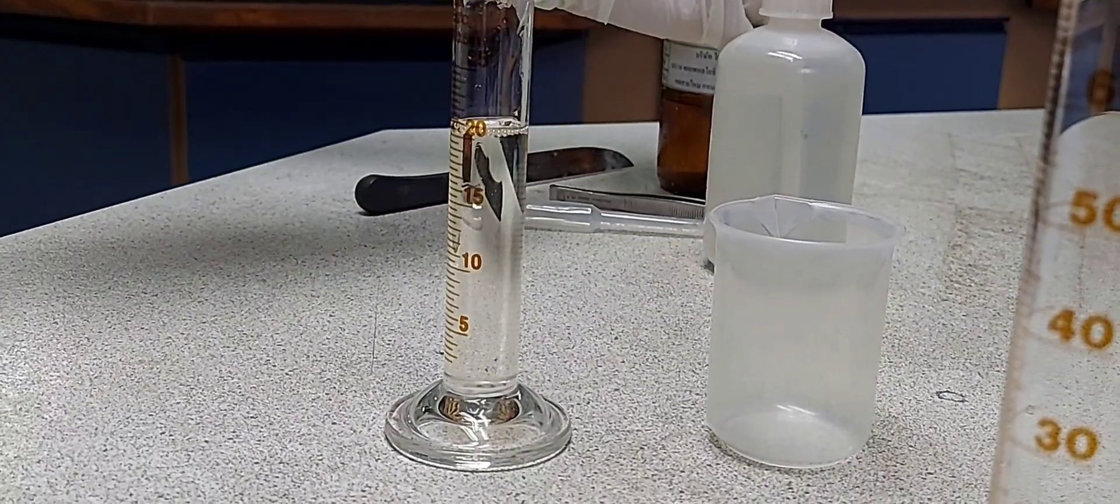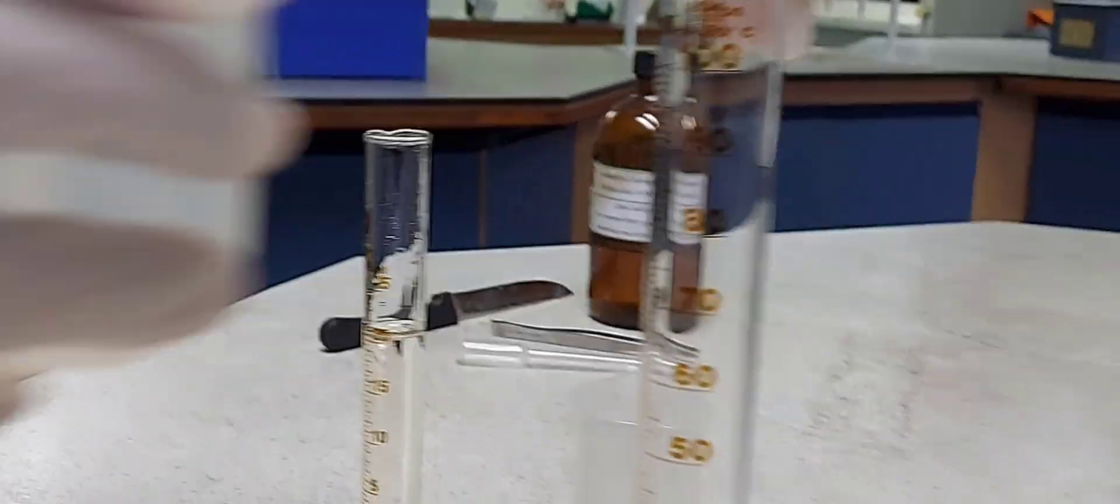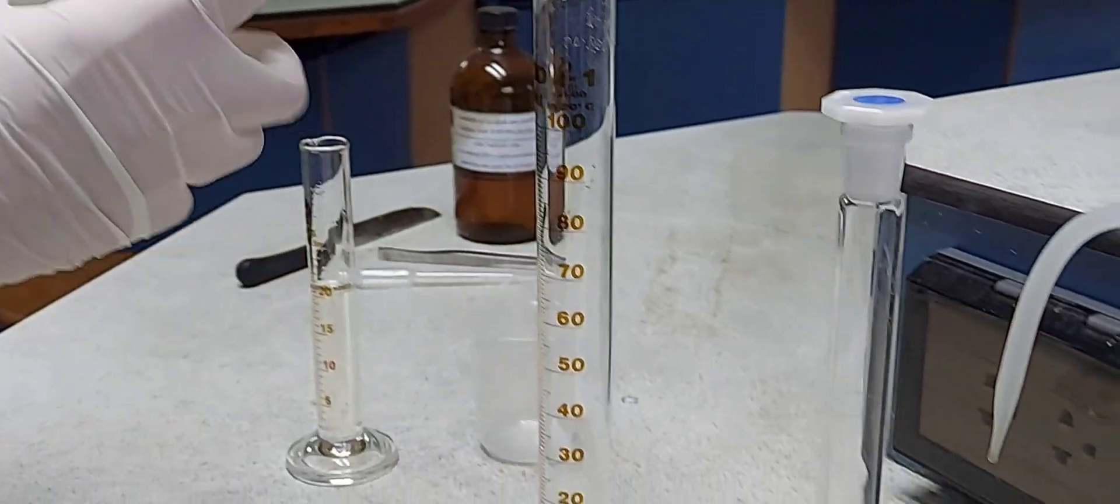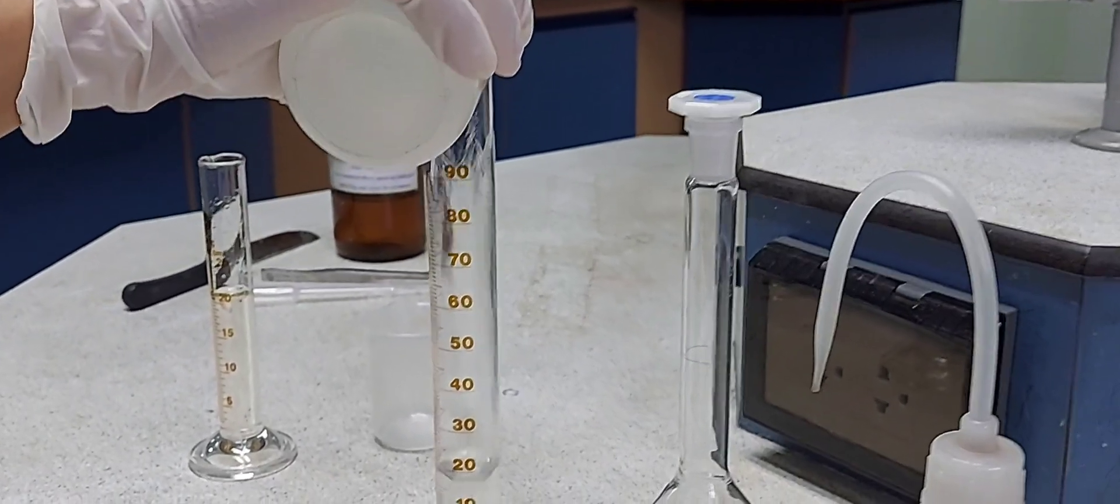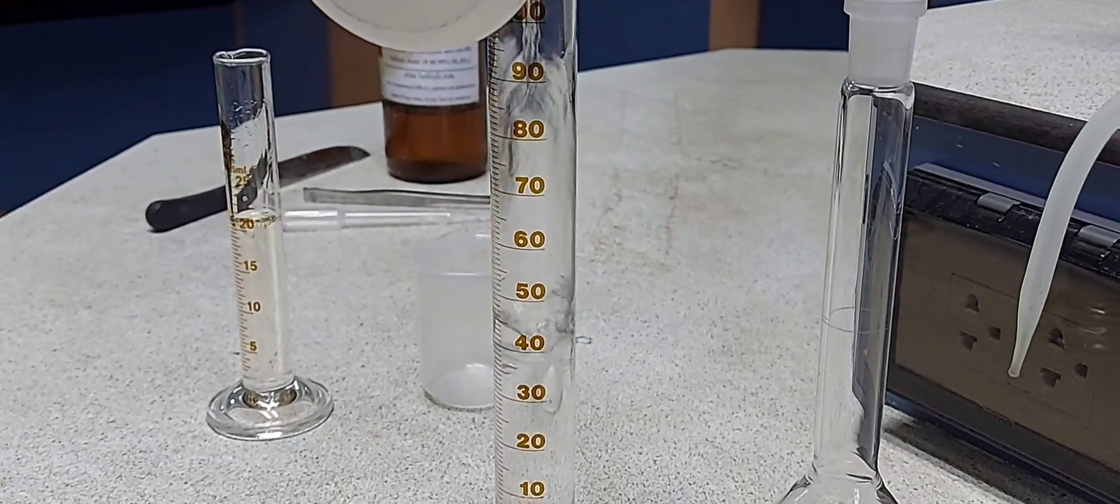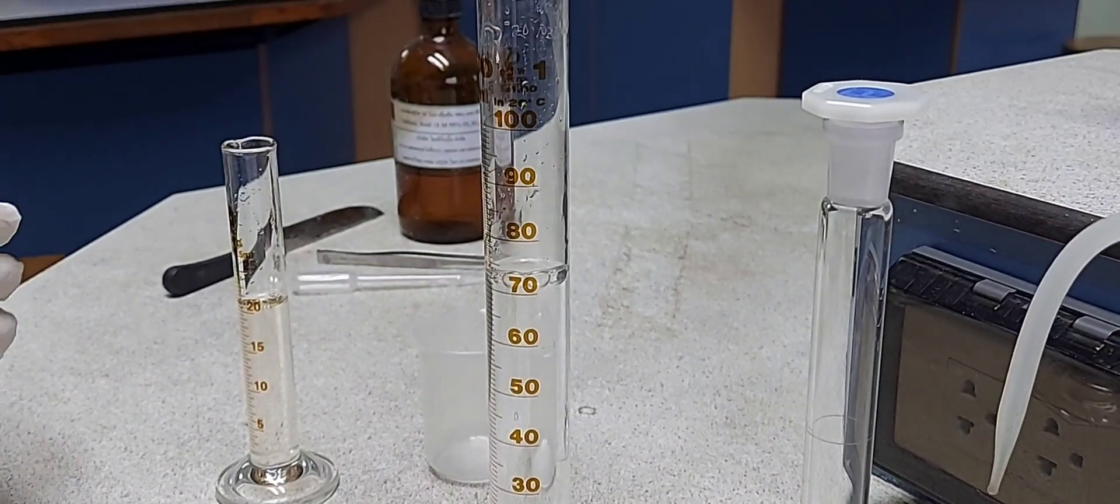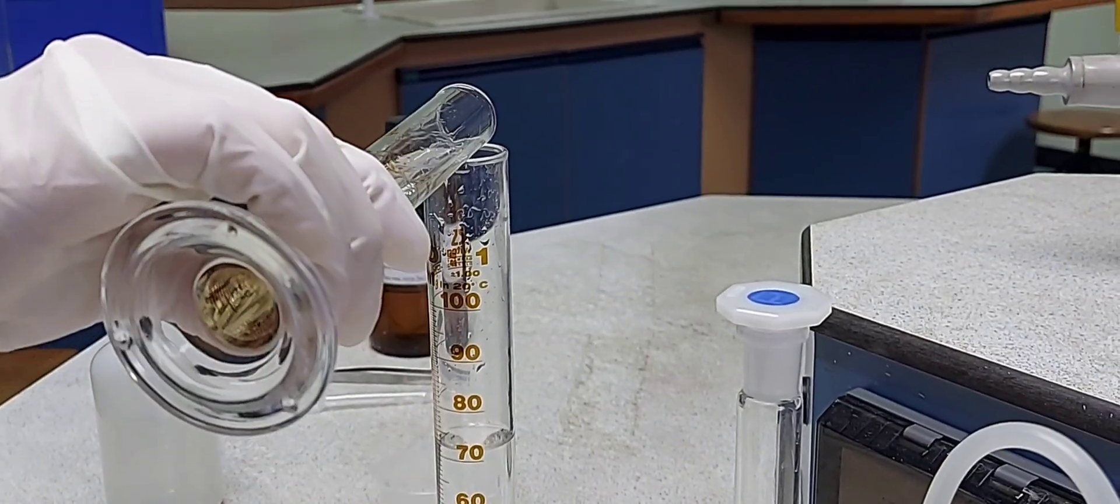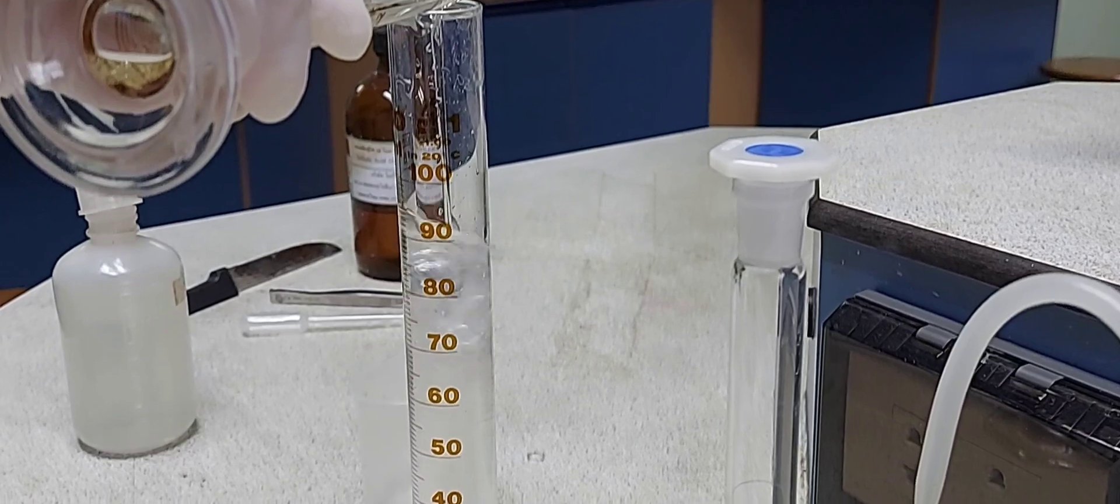So 20.8 ml of concentrated 18 molar acid, and then I am taking about 70 ml of water and adding the remaining acid to the water slowly and gradually.